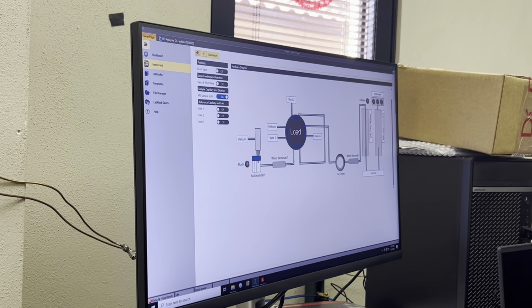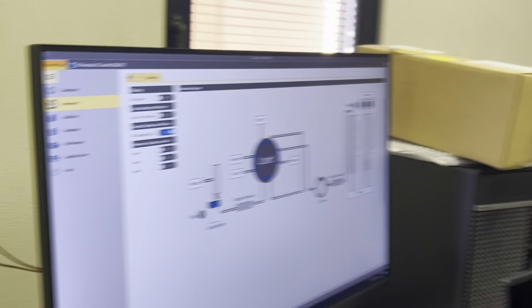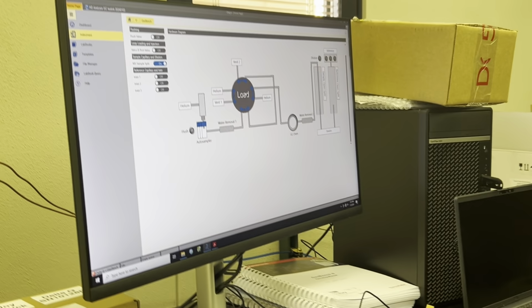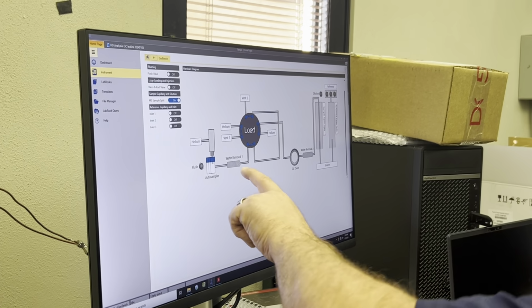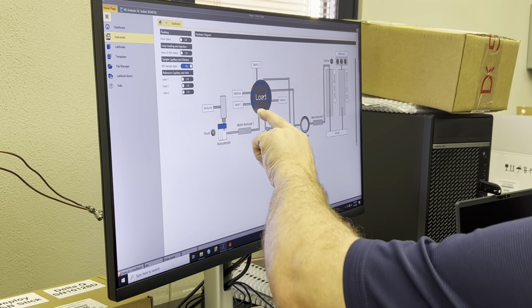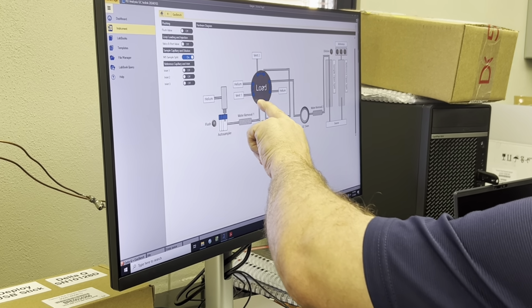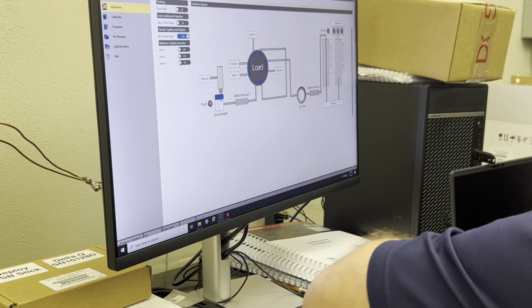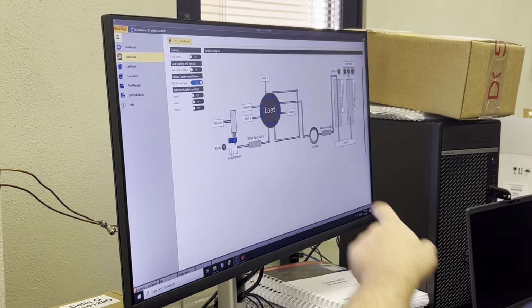It's not drawn well here, but you've got your sample, your helium comes into your needle here, it'll go into the tube, flush the tube out, and come back down this line here. It comes down the capillary and then goes into the first Nafion. It will then go into that 8-way valve, go through the loop and then empty to atmosphere. So it'll continually do that. It's got a slow flow rate, so it just keeps flushing, and then after a period of time, you switch it.